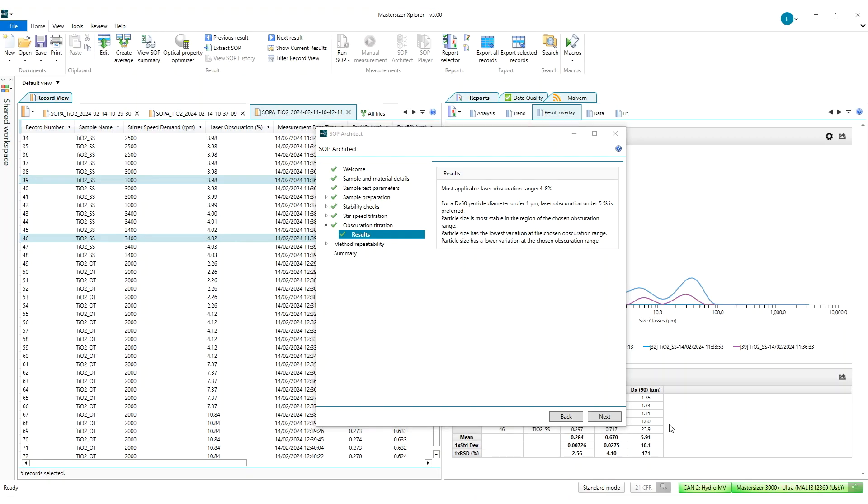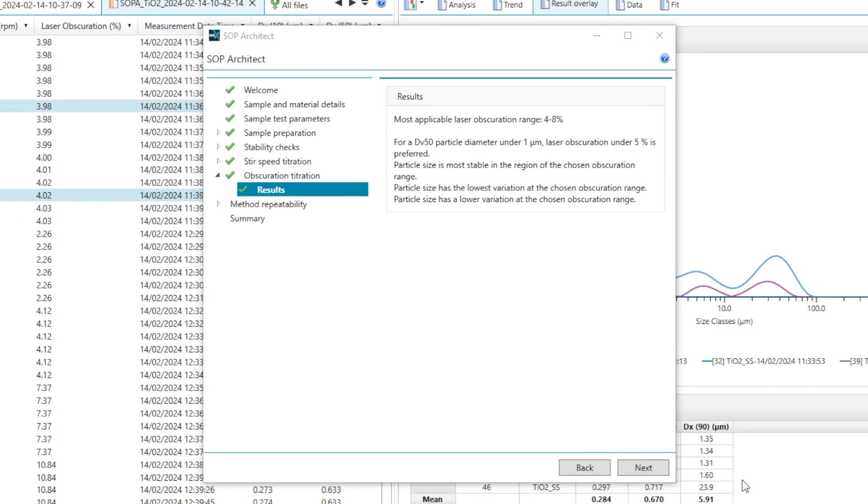So now that our obscuration titration has finished we can see that SOP Architect has given us an ideal obscuration range of between four and eight percent. This should give us a good amount of signal such that we have good signal to noise whilst minimizing the amount of multiple scattering that may be occurring that can lead to overestimating the amount of fines within our particle size distribution.